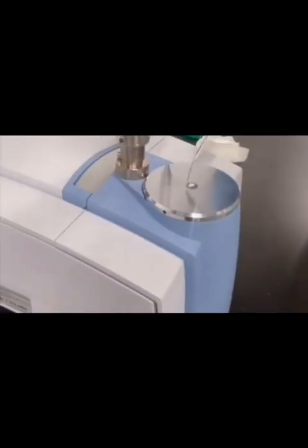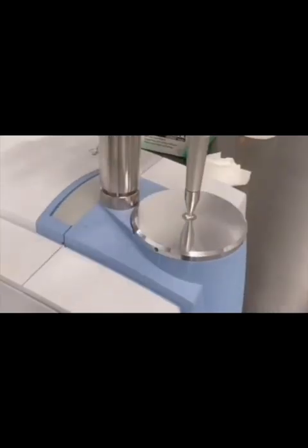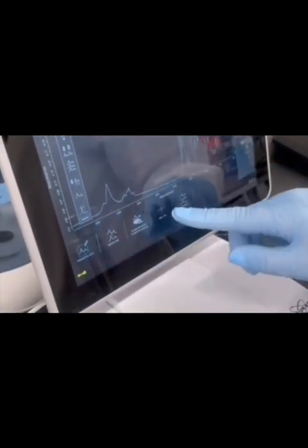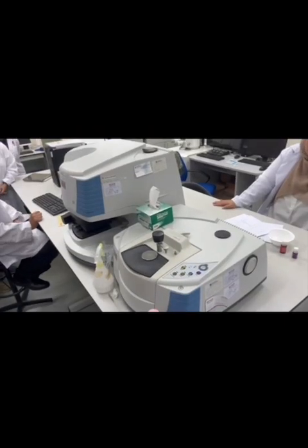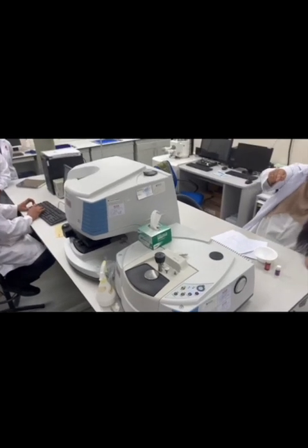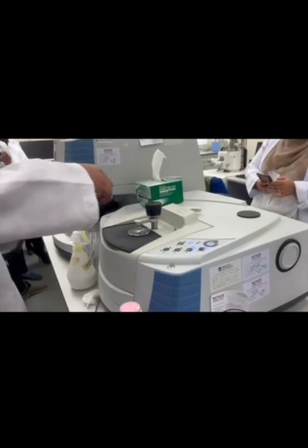Fourth is variable control. Control collection time, leaf health, and storage condition for reproducible and consistent spectra. Fifth is handling. Avoid freezing, to preserve the natural state of the leaf for accurate analysis. Sixth is rigorous preservation. Maintain sample integrity throughout the preparation technique for high quality reproducible data. Seventh is significance. Proper sampling ensures reliable FTIR data reflecting true sample characteristics. In summary, meticulous sampling ensures high quality reliable data for FTIR spectroscopy analysis.